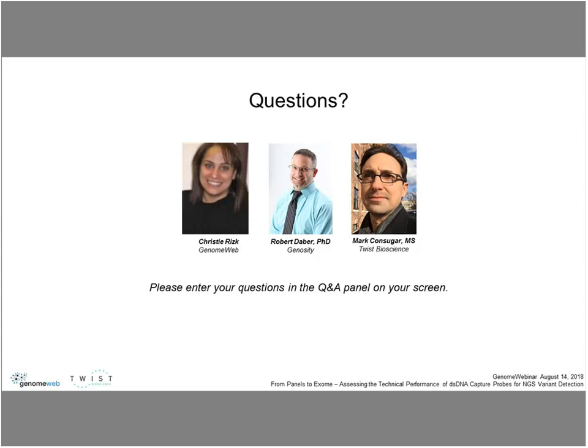Great. Mark, going back to you, will automation be available on the Agilent Bravo automated liquid handling platform? Yes, that is something that we are working on scripting ourselves. Okay.